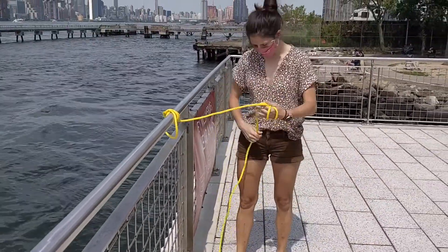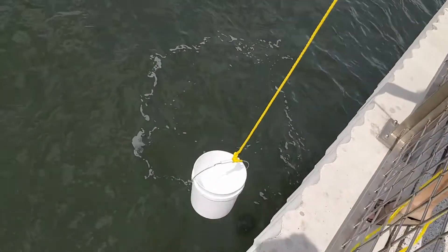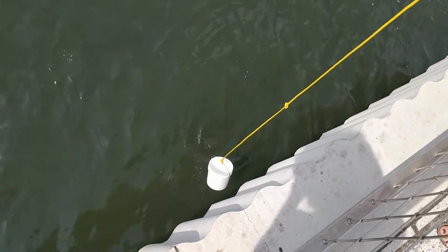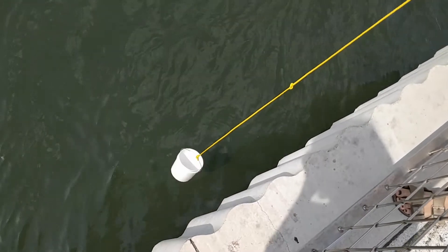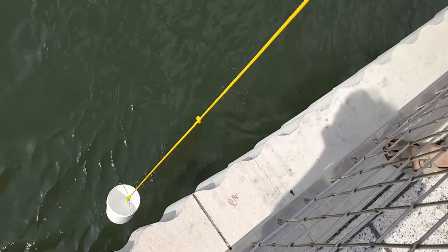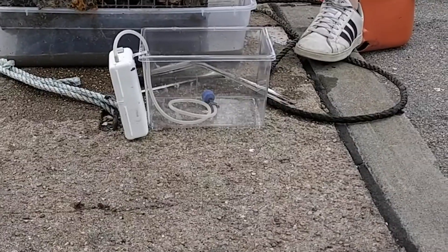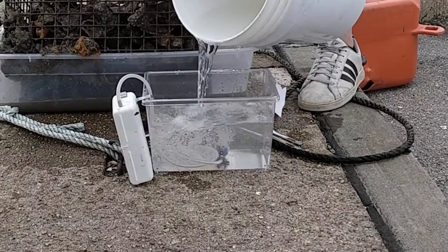I also like to wrap the line around my hand a couple of times. When collecting water, if you drop the bucket straight down it will float. The best strategy I found is to sway the bucket and drop it in order to scoop the water. Fill your critter tank with the water you collected and turn on the bubbler. You may need to refill your water bucket after this step.